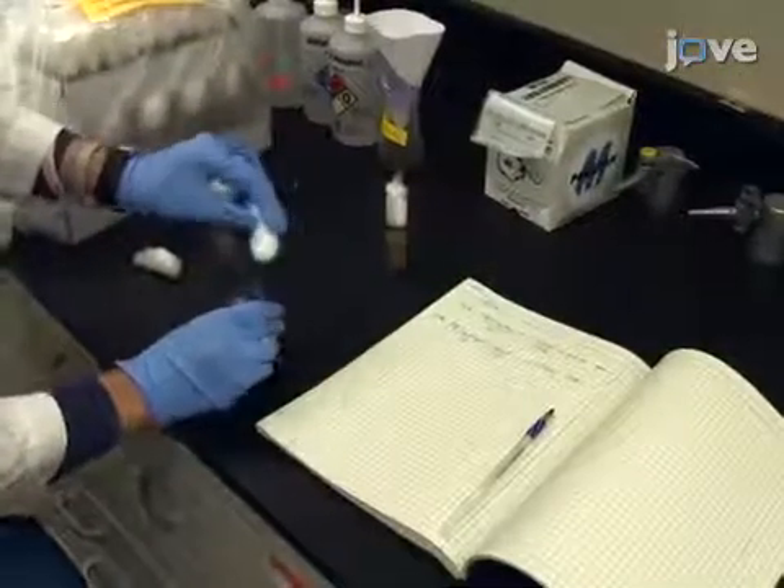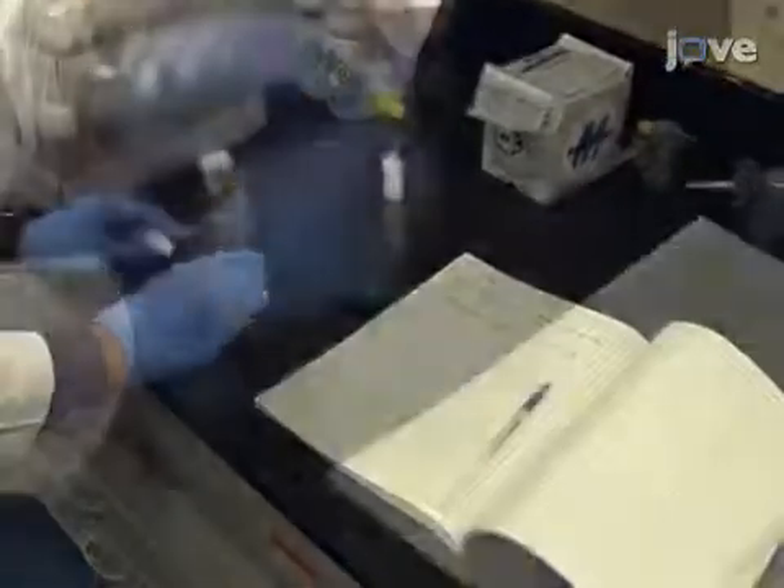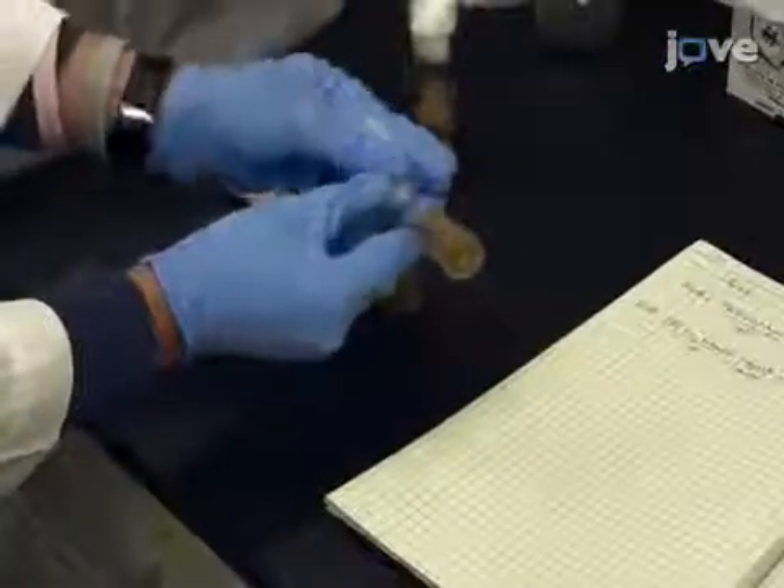Once the flies have laid eggs, transfer the crosses into new vials. Document the start and end times of the egg laying period.